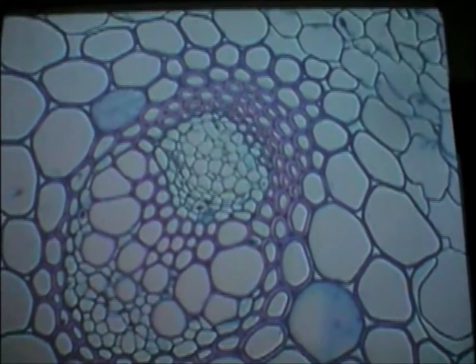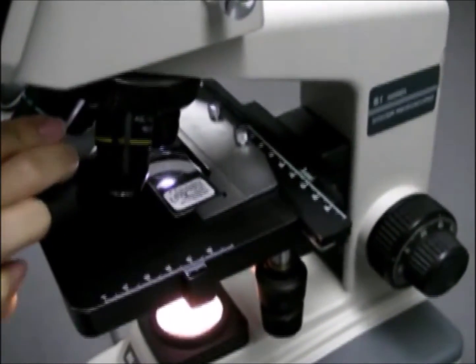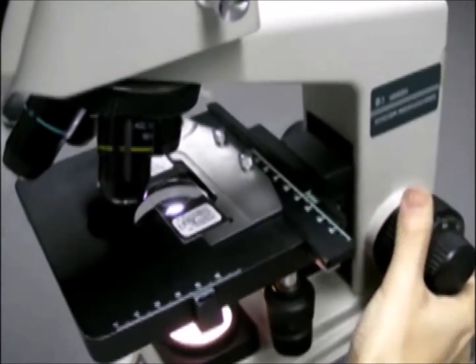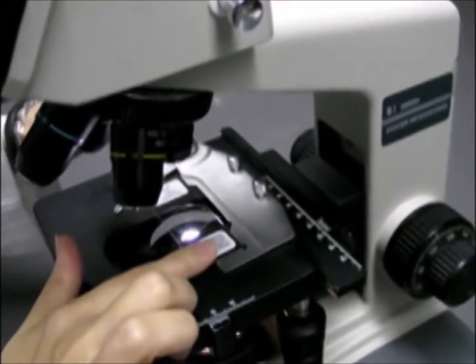So, turn it back to the shortest objective lens and then turn it down. Now it's easy to take out.